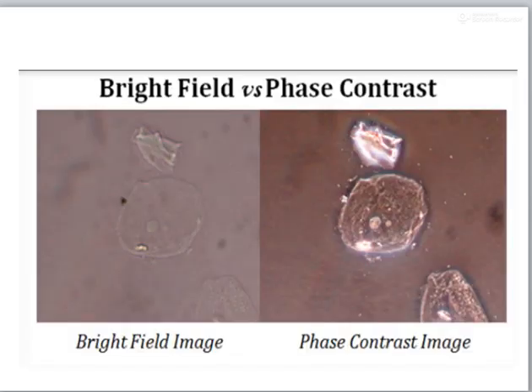Now, this is the high contrast, as we can see. If this is bright field microscopy, you can see it only like this. But since small phase shifts are also being amplified and detected using the phase plate, what happens? High contrast happens in phase contrast microscopy.